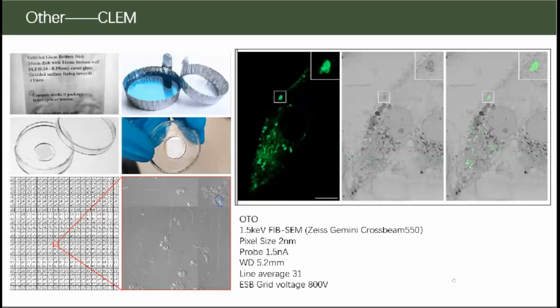In these slides, I'd like to talk about some methods I did with correlative light and electron microscopy. I think if you want to gather good data from LM and EM, you should get a high resolution light imaging first. I think using a super resolution light microscope is better, and you need serial images by the FIB. It's an easier match than other methods.